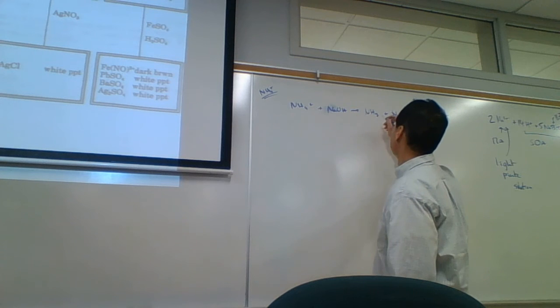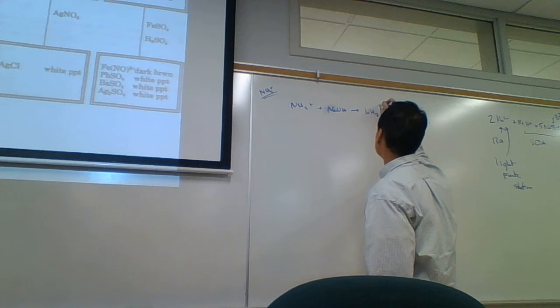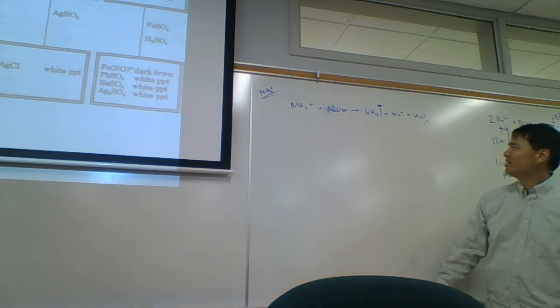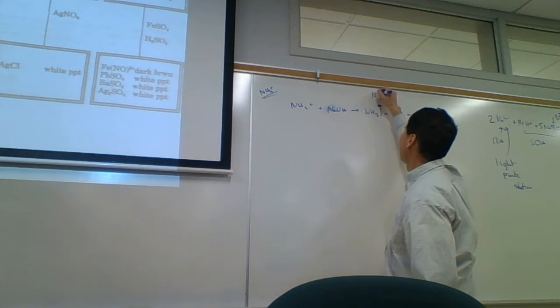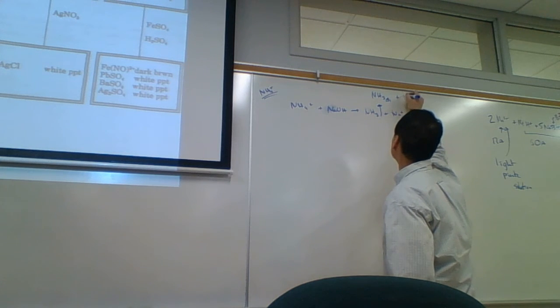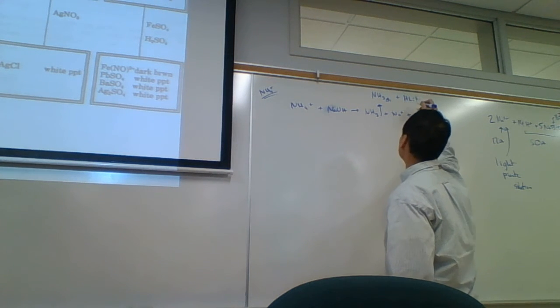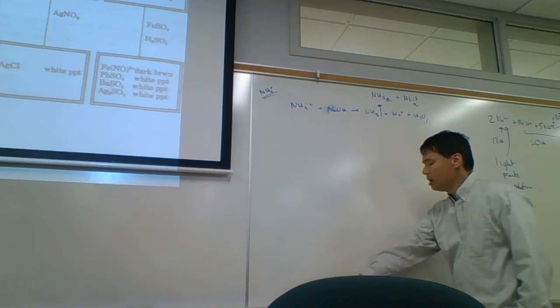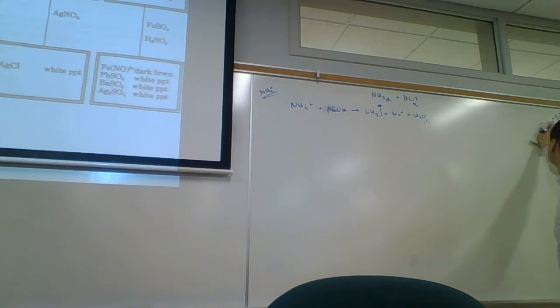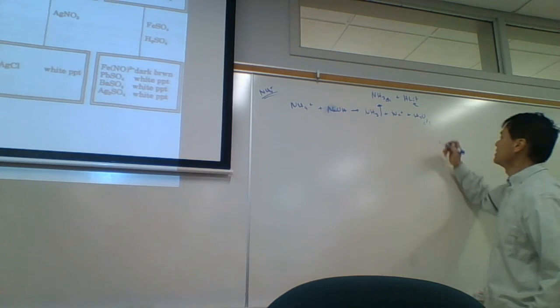Ammonia is normally a gas, and it can evaporate off the surface. If ammonia evaporates off the surface, it will form ammonia gas, NH3 gas. And then we can test that with litmus. Blue litmus is for acids. Red litmus is for bases. And so what we're going to do is test this with red litmus.